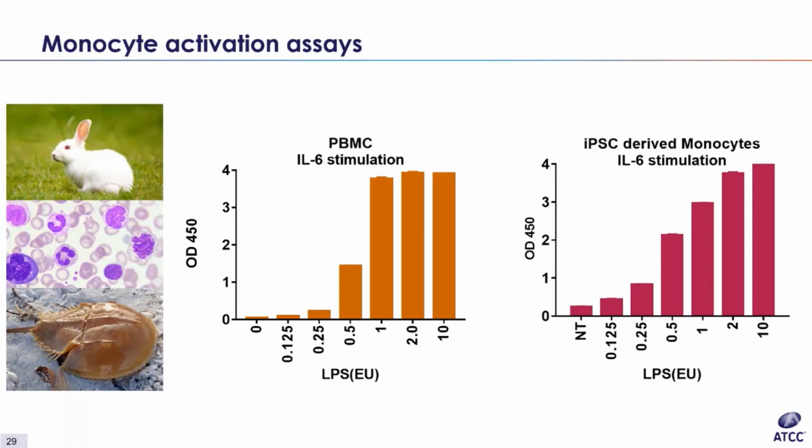Then there's the limulus amoebocyte lysate or LAL method, which requires the blood of the horseshoe crab. Either a gel clot is then detected, or more commonly now, a change in color or turbidity is measured. Unlike the rabbit pyrogen test, the LAL assay is limited by being unable to detect non-endotoxin pyrogens. And also, since thousands of horseshoe crabs are bled for this per year, and there's probably about a 25% mortality rate, the horseshoe crabs would probably prefer to be left out of this.